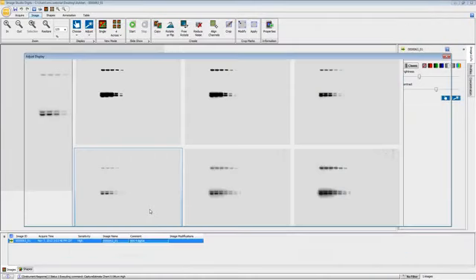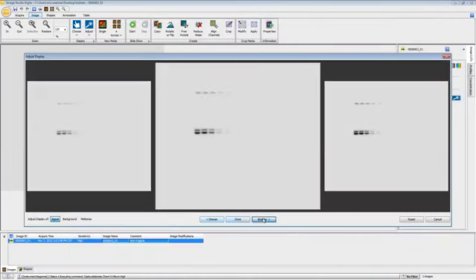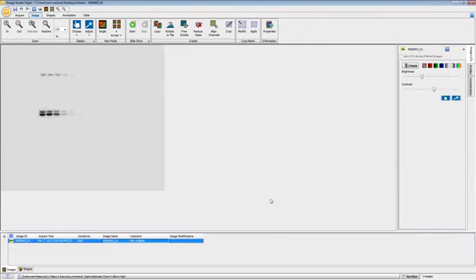Once you have your C-Digit image, use the image adjustment tool in Image Studio to refine the look of your image and find the best representation for your data.